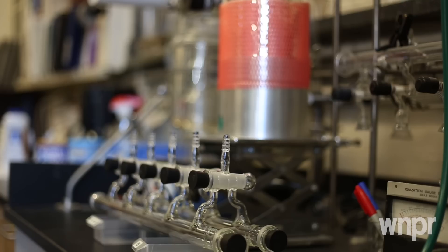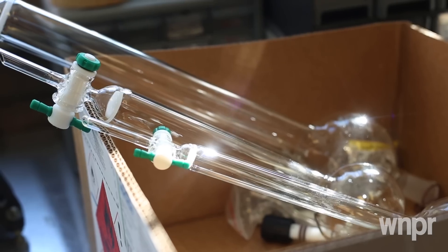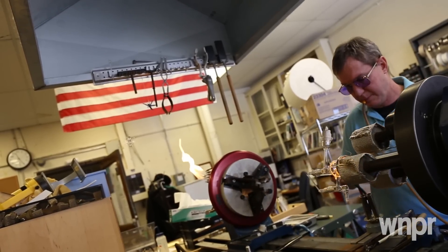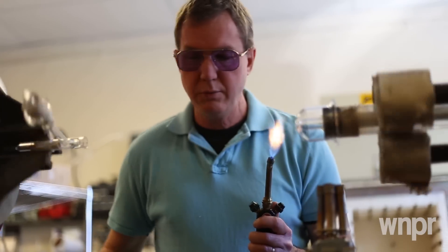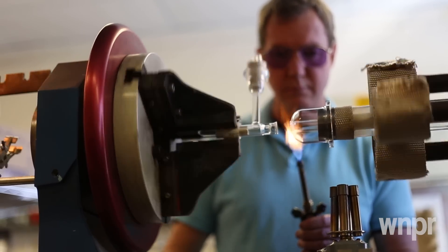Lots of times they'll come in here and they'll have the idea of what they want to make. And it's funny because they'll go like, oh, I want to make it simple. I just want to make a box, a square box. And you can see from all my starting material, there's nothing — there's no box. There's cylinders and spheres and things like that. So glass does not like sharp right angles like that.